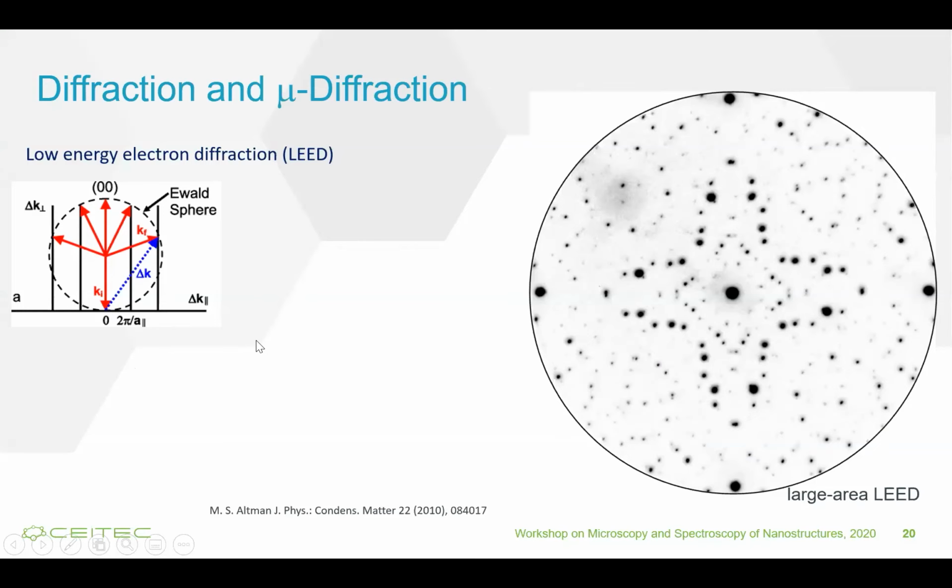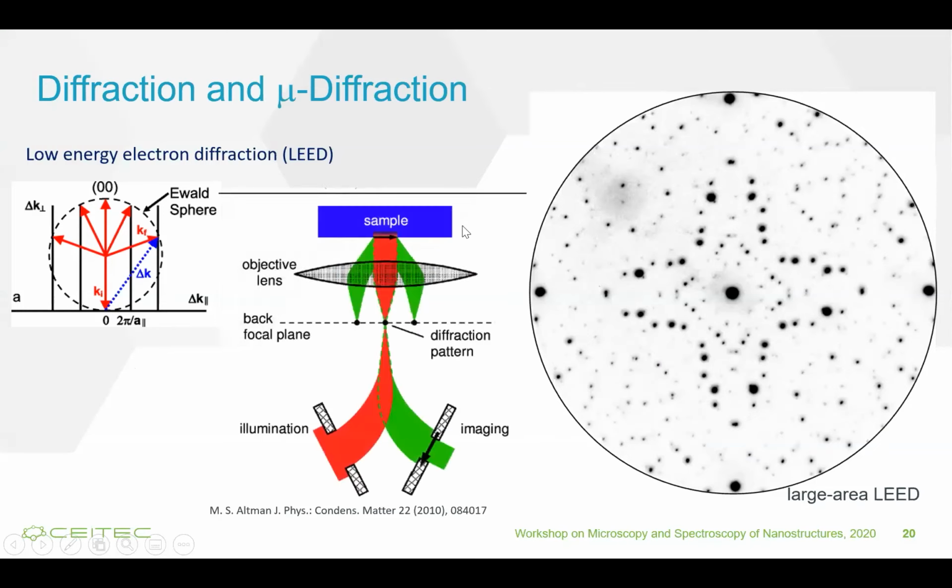So we actually see the image of the reciprocal space. And in LEEM, we have access to the diffraction pattern just in the back focal plane of the objective lens. So we can image that easily, and we can switch from real space to reciprocal space in less than 1 second. So we can watch what's happening, check the diffraction pattern, then again watch the real space.